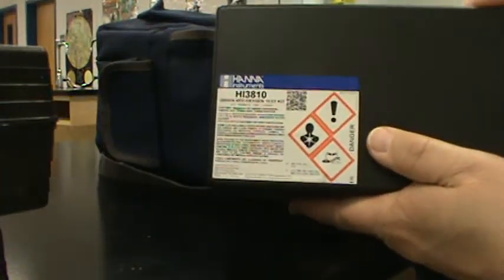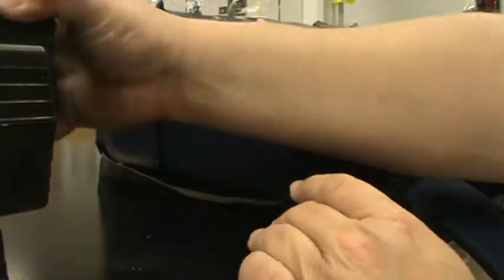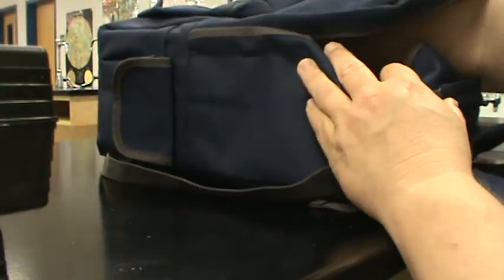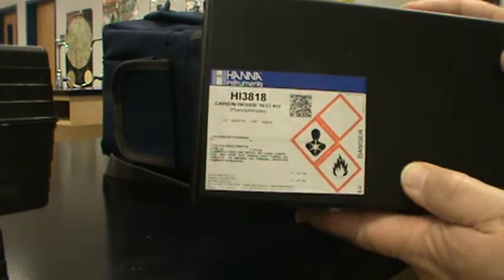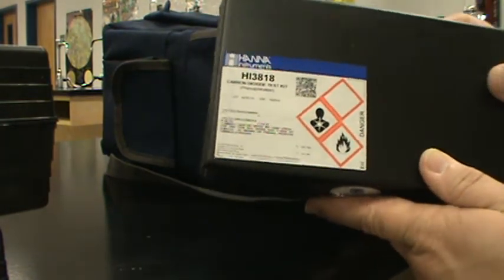And we have my personal favorite, the dissolved oxygen test kit. Oxygen content in water is very important, because as we know, without oxygen, well, there's my carbon dioxide test kit. I was wondering where that went to. Oxygen and carbon dioxide.